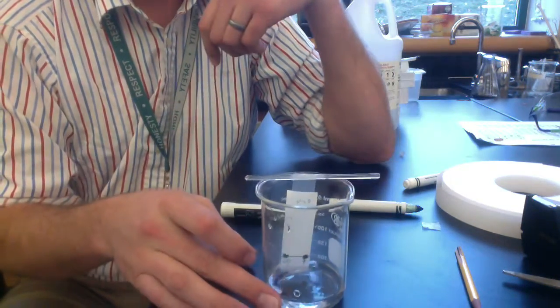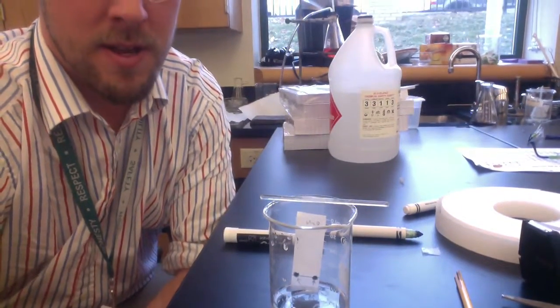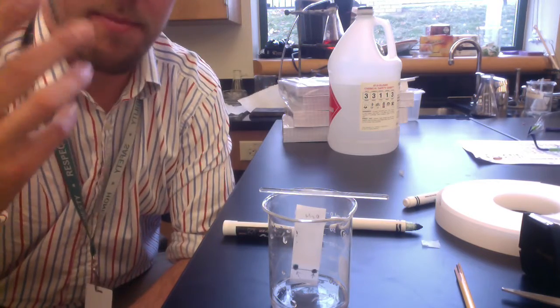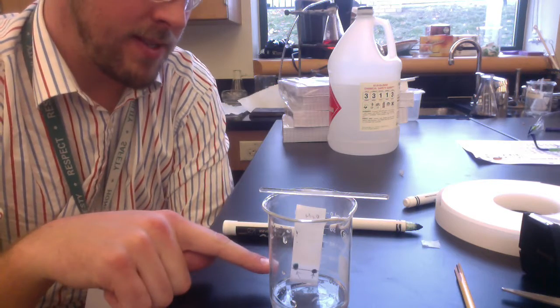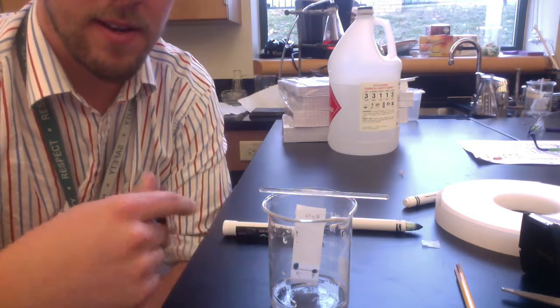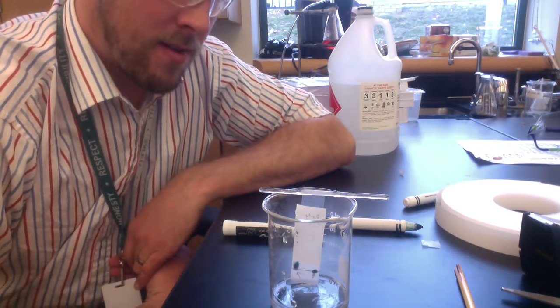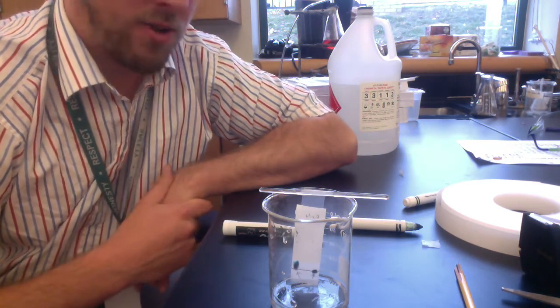Okay, so now what should be happening here is something called capillary action. The chromatography paper is a special paper that basically has very small pores in it. It allows water and pigments to travel through it, and you can see that water rising up. On this side we've got the washable marker, and on this side we've got the dry erase marker. You'll notice that the washable marker is traveling up the paper. The dry erase marker is just staying there.